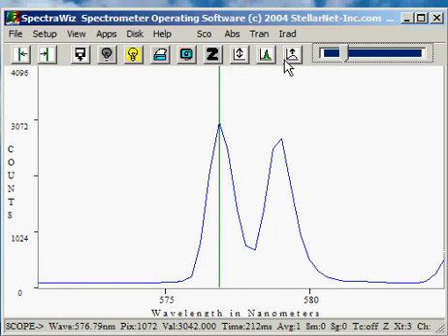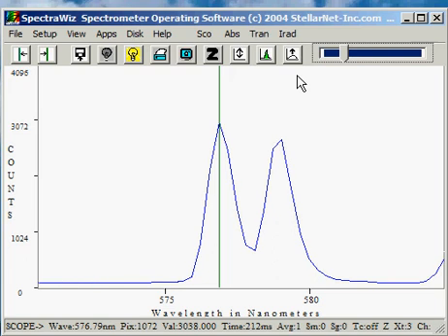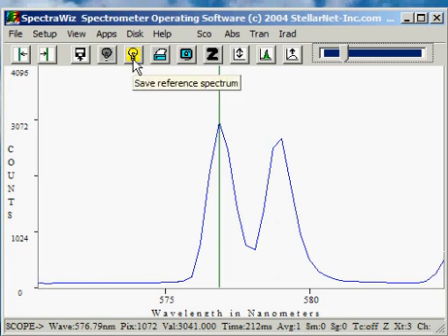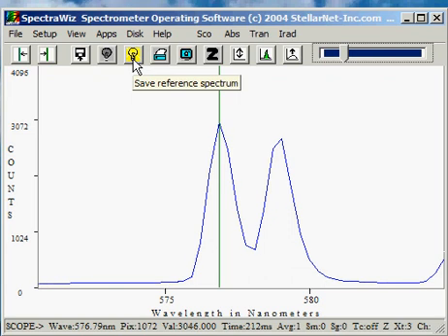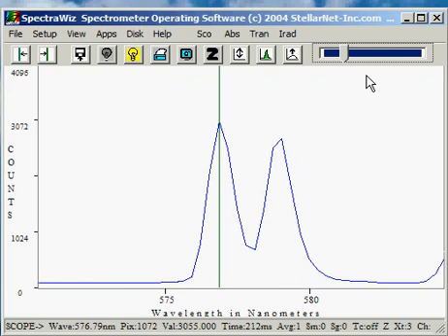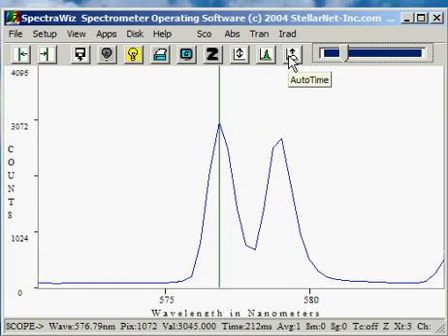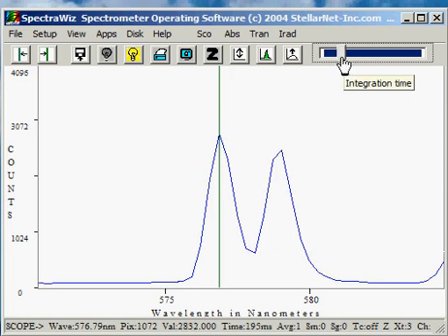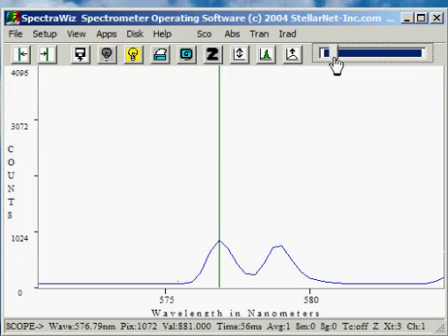The next icon is the auto-time. This allows you to save the highest possible reference spectrum when you're about to save a reference spectrum. The setup procedure automatically increases the detector integration time so that it's not saturated, yet it's at its highest point. We'll demonstrate this icon at a later time. The detector integration is controlled, of course, by the slide bar.